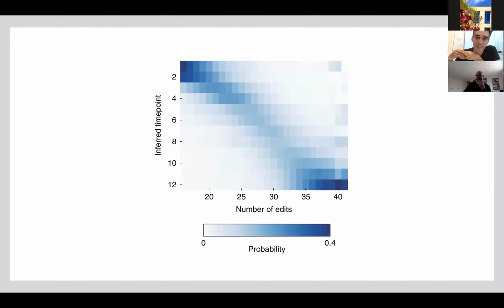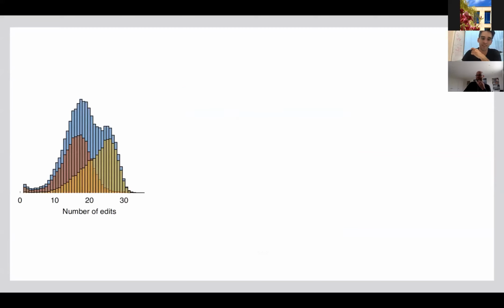But when you imagine this is actually the first way that we're able to do this for a population of different RNAs in the cell, this is pretty cool. We're actually able to, for each RNA, look at how old that RNA is. But of course, you're never looking at individual RNAs. You're usually looking at populations of RNAs that are created in an event. And when you have a population of RNAs, you get improved time resolution because you get to do some statistics.